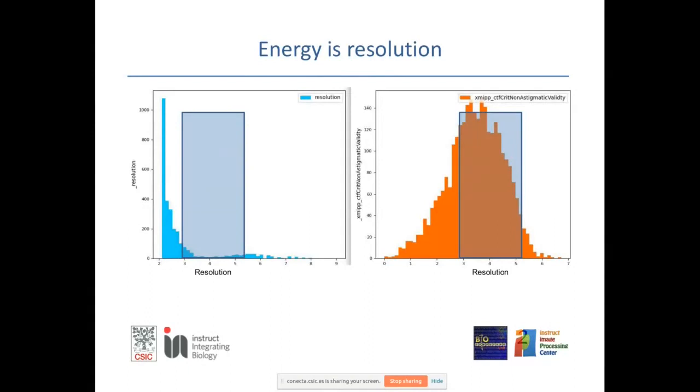This may not be the case, and this was the case of this example, because the energy that you have in both directions, in the direction U and V of the 2D defocus, might be different. So as the 3D reconstruction is assuming perfectly non-astigmatic images, if your 2D defocus are different, then you are violating this non-astigmatic assumption.